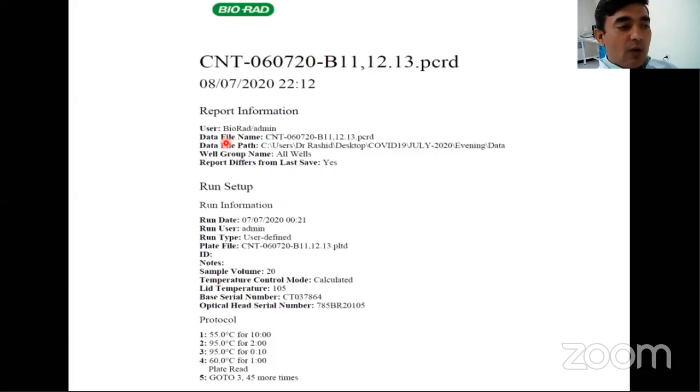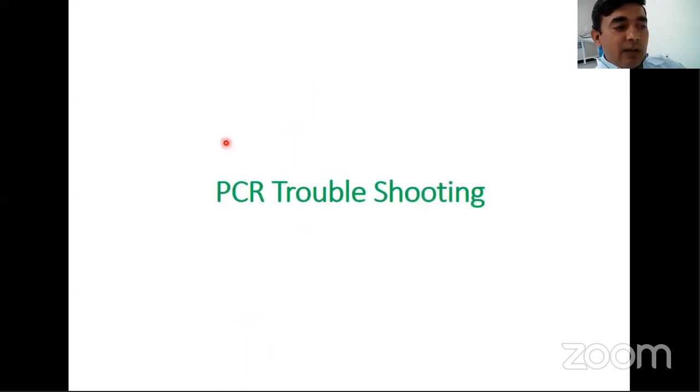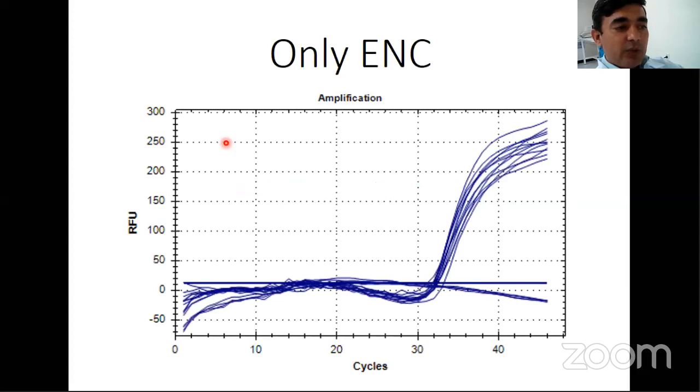I will show you from the live session in the next few minutes, because I want the PCR which we already set up to be in process and completed. So I'm going to show you this information later on. I will now talk about some of the PCR troubleshooting.